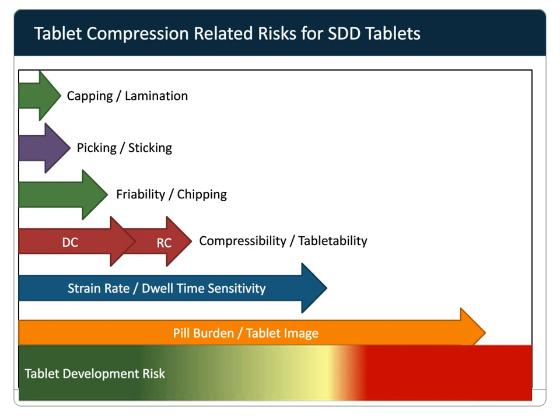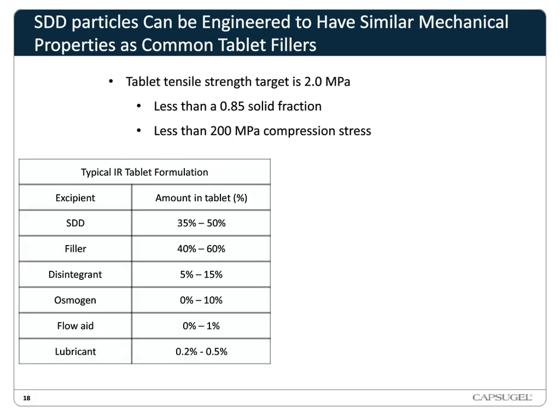So here's what I mean by that. This slide shows a typical IR tablet formulation. And what we're trying to convey is that SDD particles can be engineered to have similar mechanical properties as common tablet fillers. So if we look in our typical IR tablet formulation, we see that the IR tablet is comprised of about 40 to 60% filler.